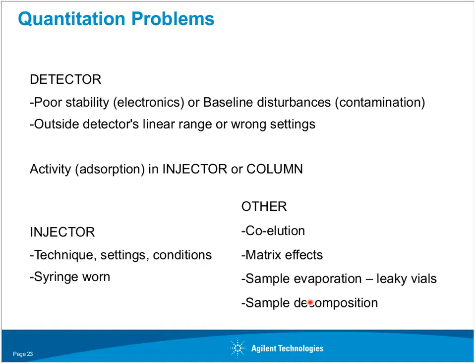A lot of customers start and they go right to the GC or the column and start troubleshooting without going back and taking a real good look at the sample handling or the integrity of how the sample was made up.